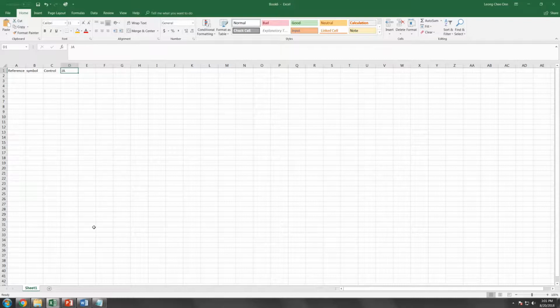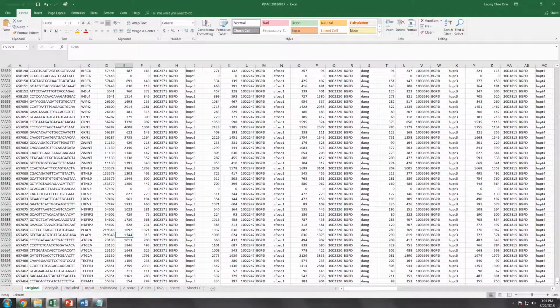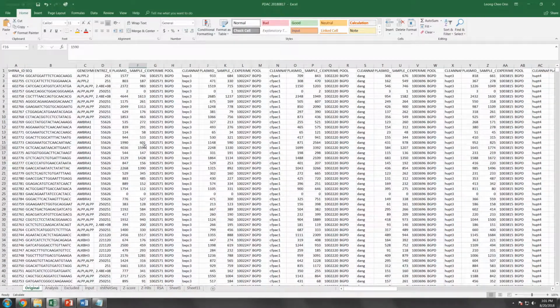Now in our case, if you remember correctly, if I go back to the original data set here, for each cell line after you have extracted, you have the column names plasmid and sample. Obviously, plasmid is the control, whereas the sample is the enrichment or the depletion of the shRNA following a prolonged period of culture, and this is somewhat similar to the treated data. But for our analysis, these are just the shRNA counts. We haven't normalized them.